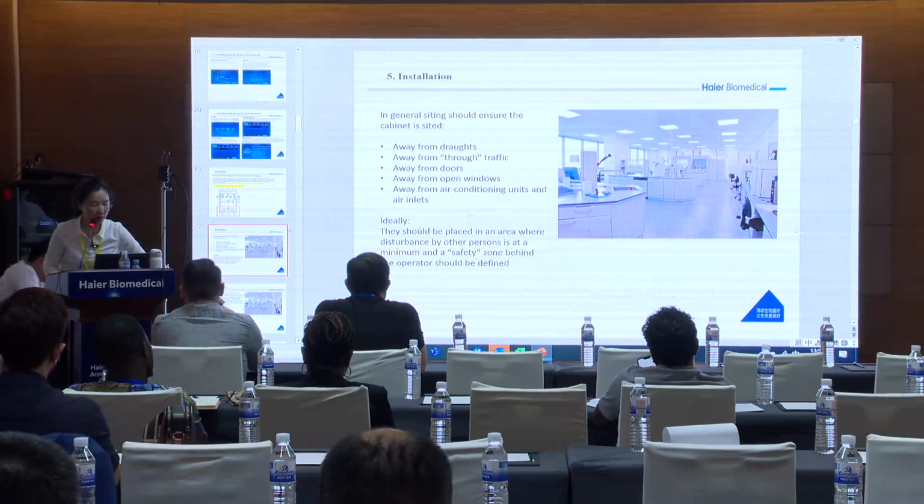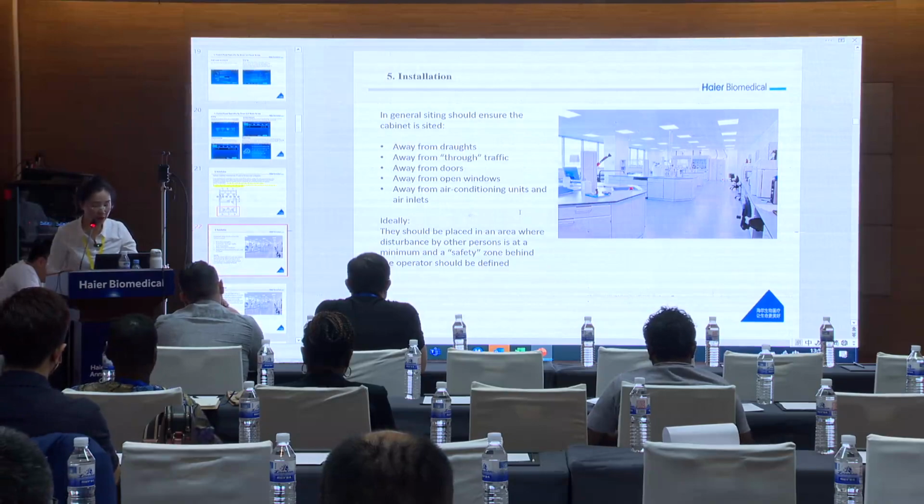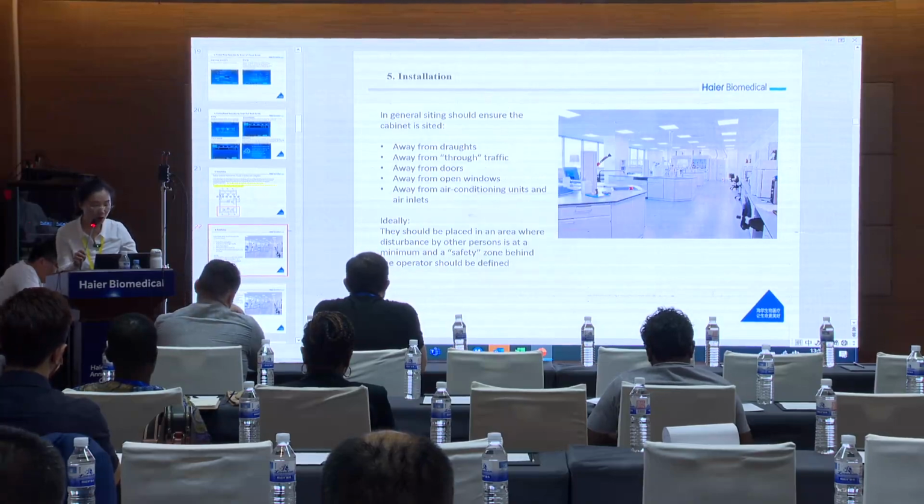Ideally, it should be placed in an area where disturbance by other persons is at a minimum, and a safety zone behind the operator should be defined.